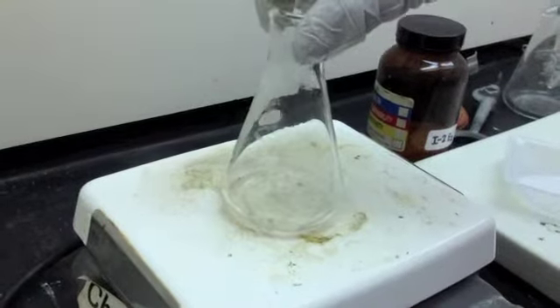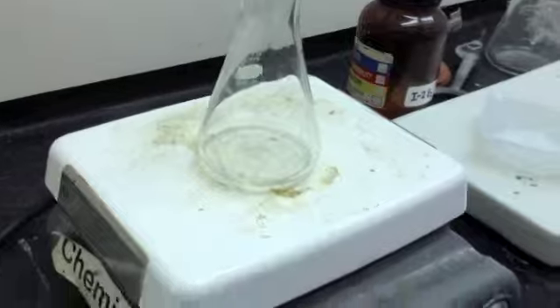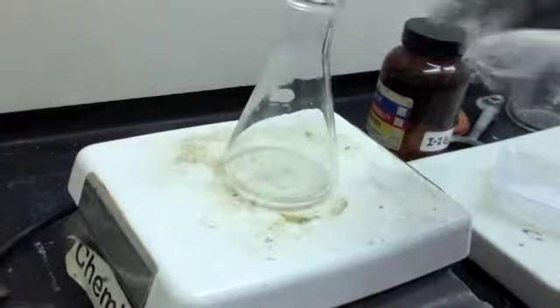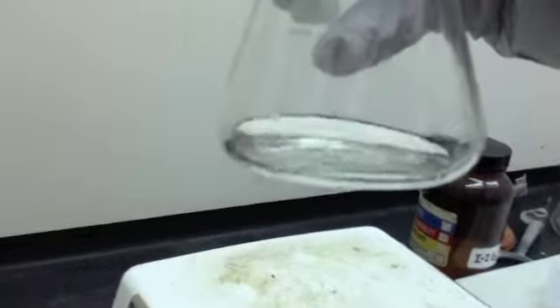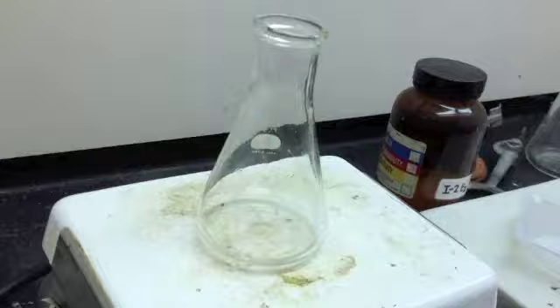You don't want it to really be boiling, although it'll help it dissolve if you're using another compound and that compound's not very soluble in the solvent. So once it's dissolved, we can let it cool to room temperature, but it's probably better if you look here that there's still a lot of solvent in here. I may have added a little bit too much, so if we let this boil off just a little bit, the recrystallization might work better.